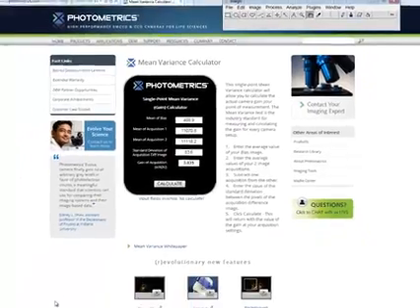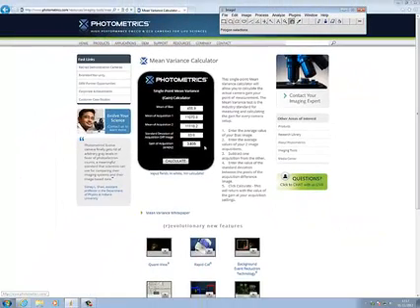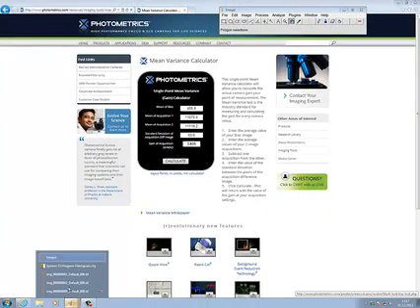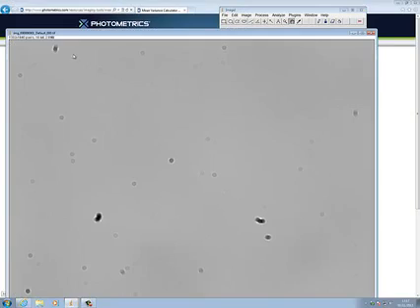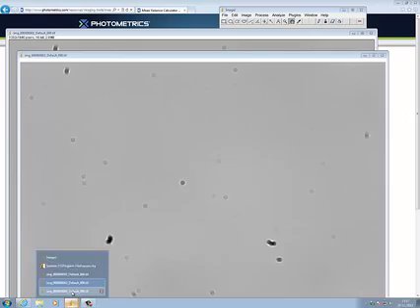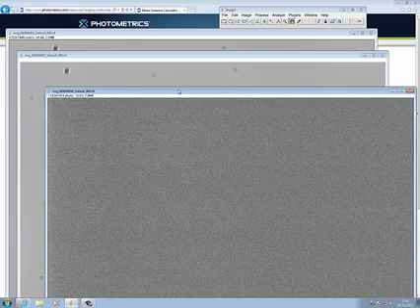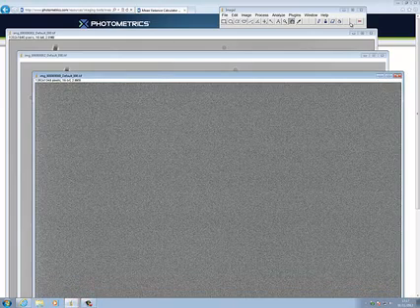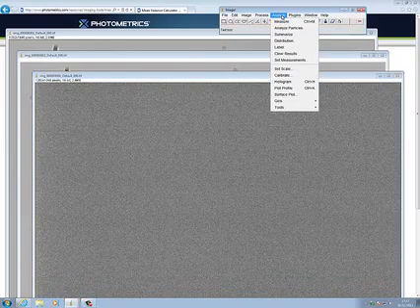Let me just go to ImageJ and let's just open up my bias image — in fact, let's just open all three. So here is my bias image. The first thing I have to do is go to Analyze, Measure.